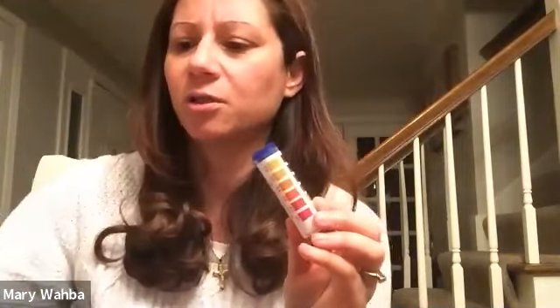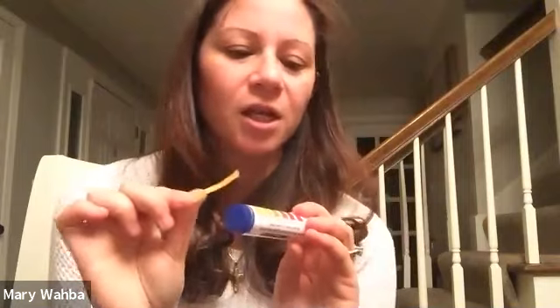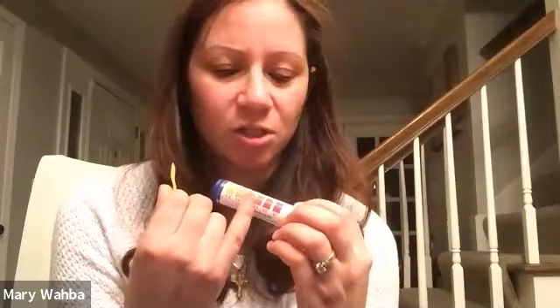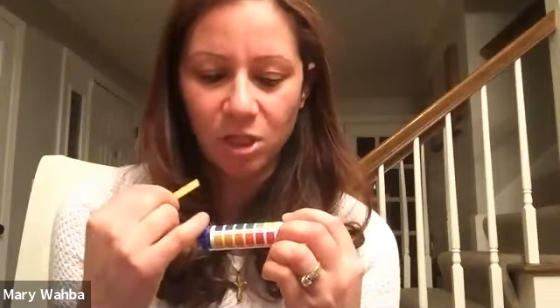Next is pH paper. You're probably more familiar with pH paper. pH paper is an orange colored paper. It looks like this. On your screen, it might be orange or yellow. Again, in a neutral solution, it will remain the same, but it's pretty cool because it turns all kinds of shades of colors. In an acidic solution, it's going to turn orange or red. In a basic solution, it's going to be purple or blue or green.